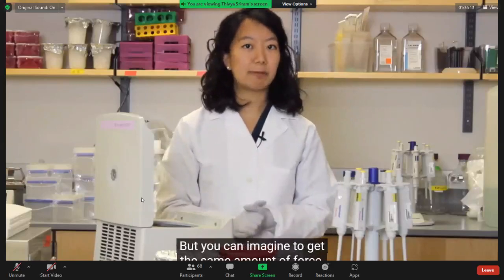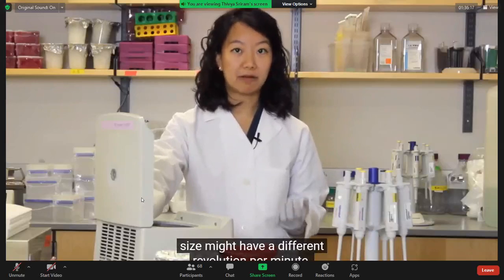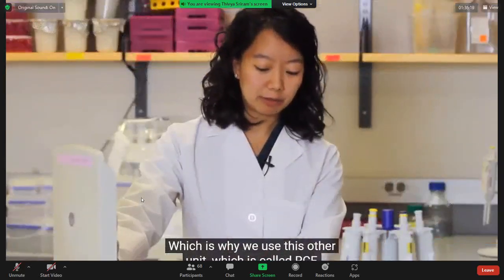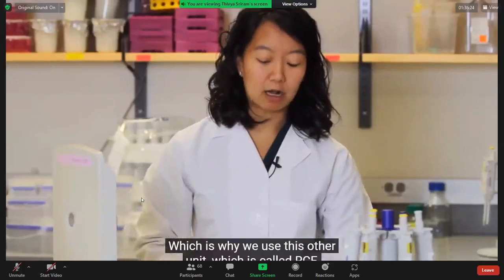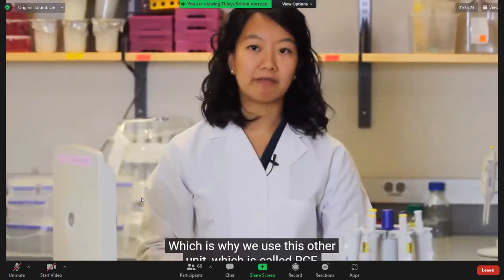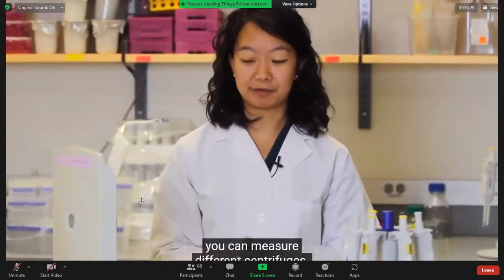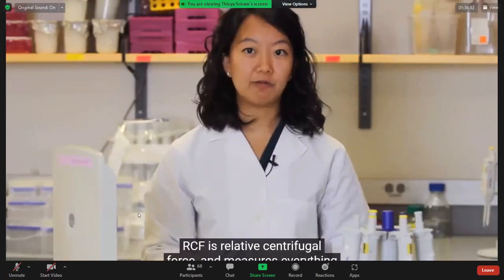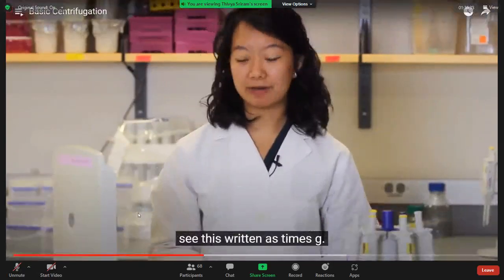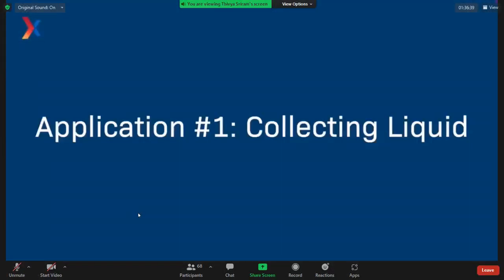But you can imagine that to get the same amount of force, a different centrifuge with a different radius or a different size might have a different revolution per minute, which is why we use this other unit, called RCF, in order to give you a more uniform unit with which you can measure different centrifuges. RCF is relative centrifugal force and measures everything relative to G, the gravitational force, which is also why in your protocol you might sometimes see this written as times G.